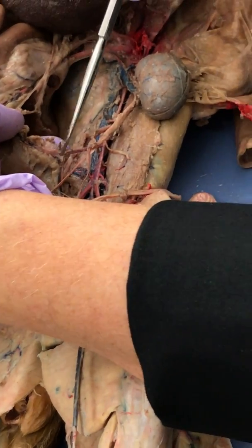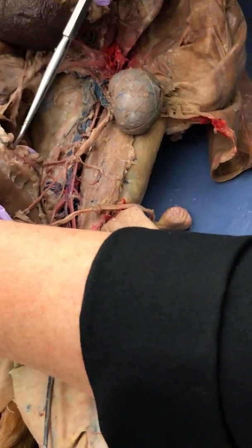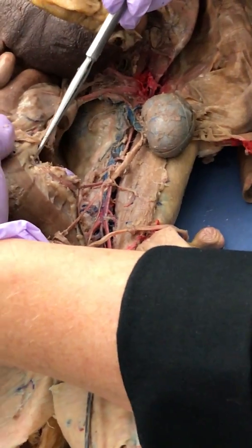Okay, and then it's a little weak, but I've got an artery right there. It is weak, I agree. Running all the way up the colon.